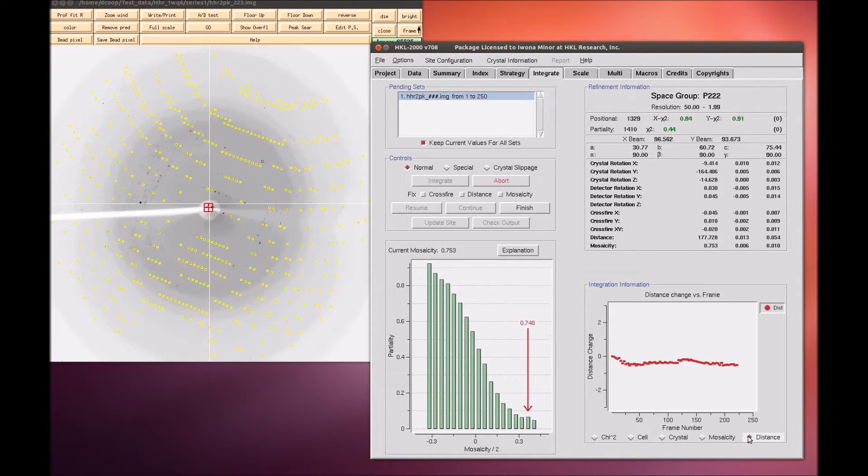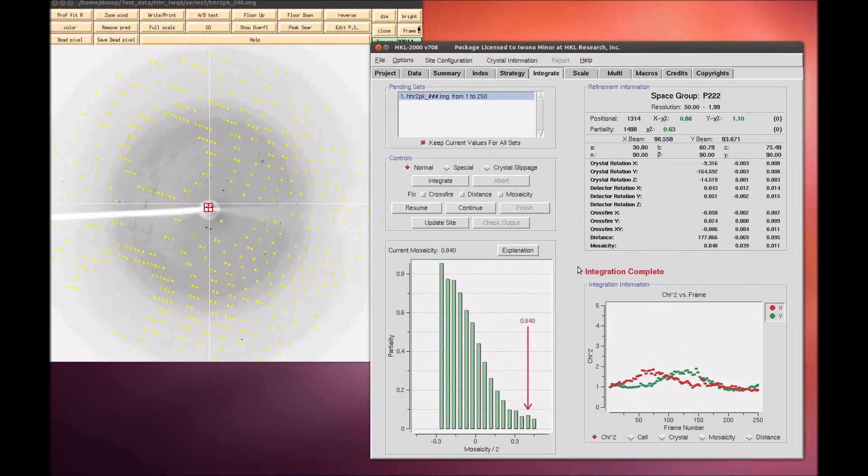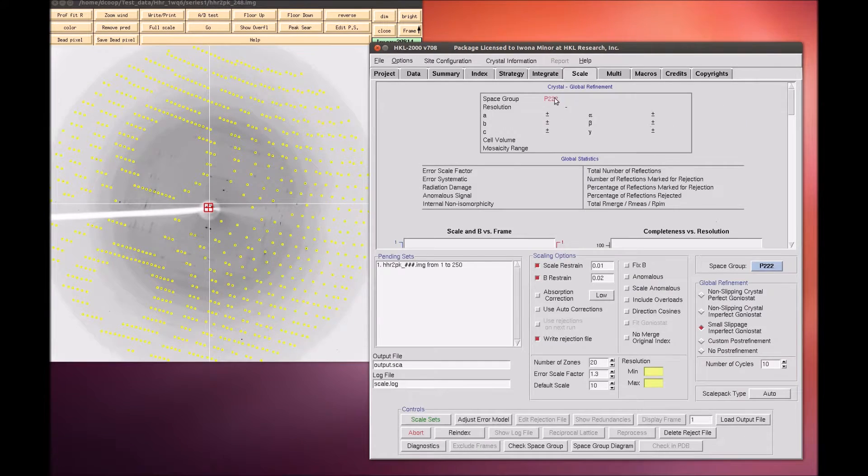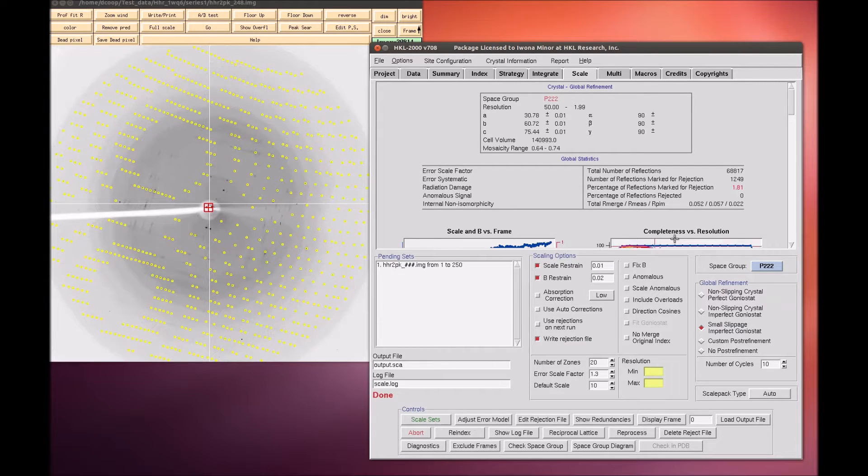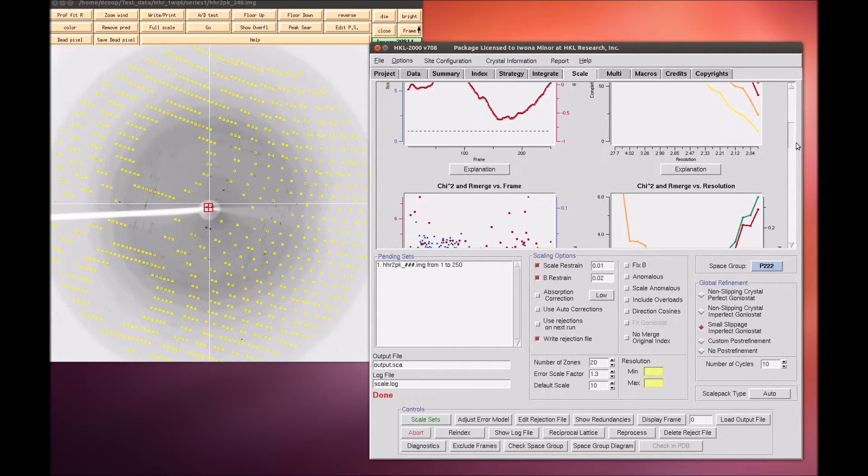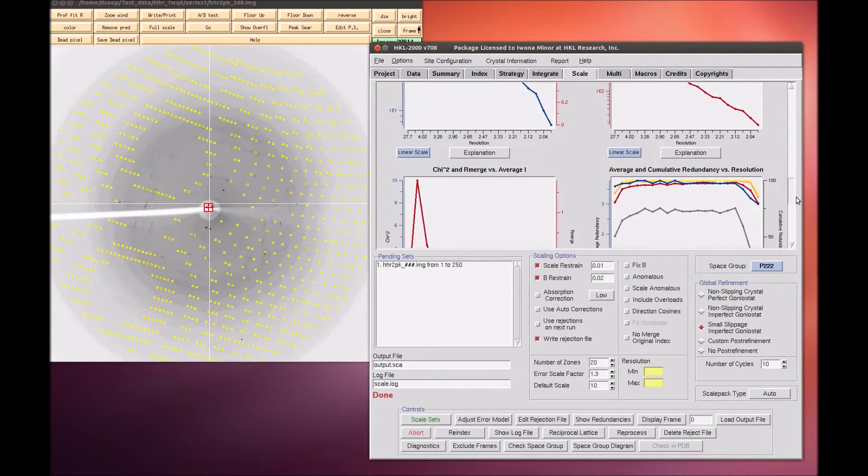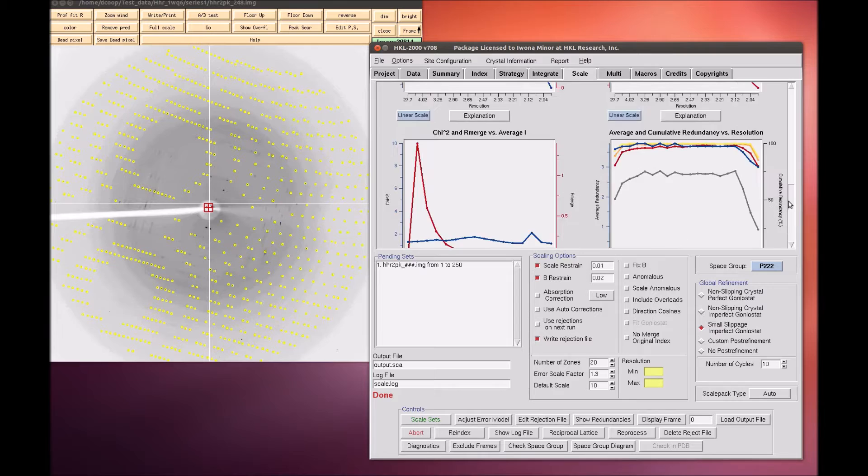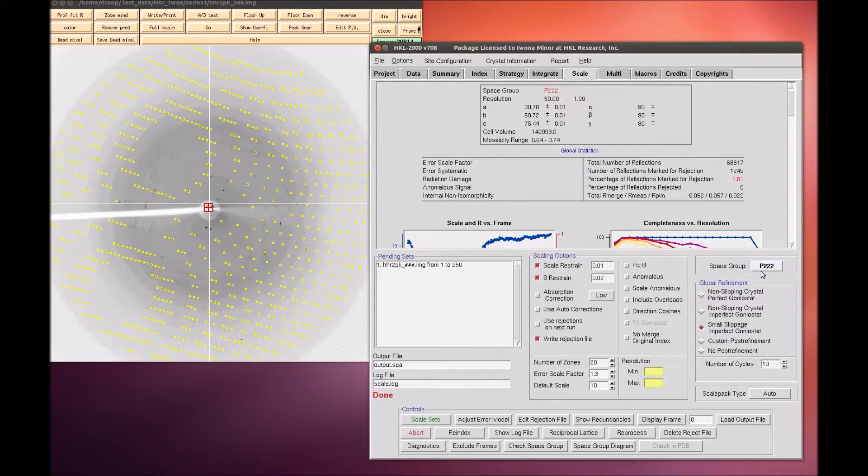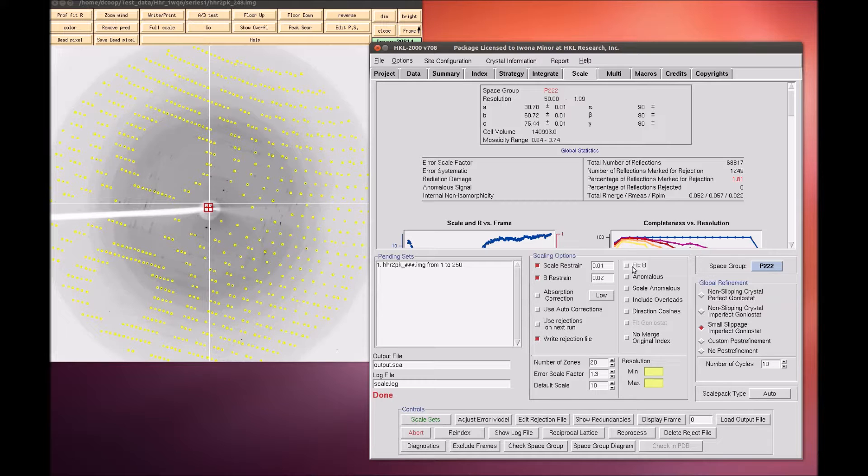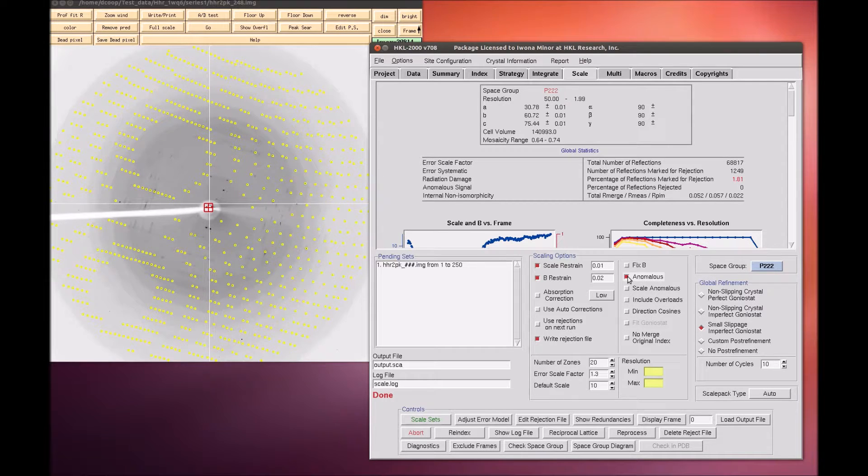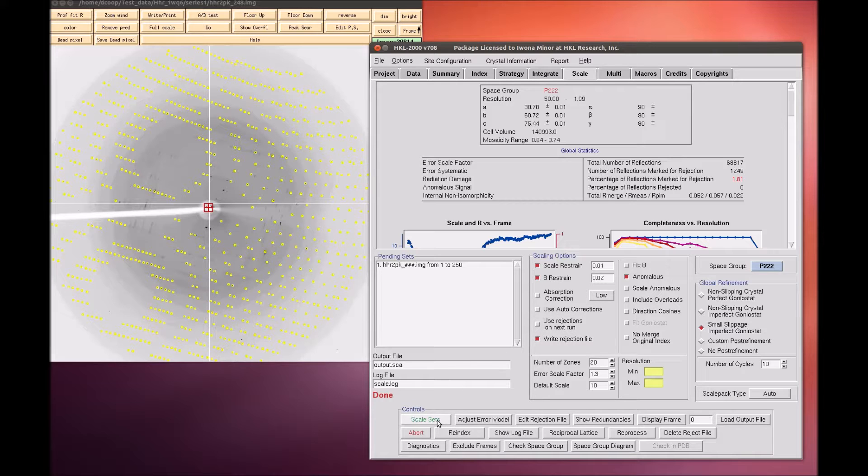Once integration is complete, it is now time to scale the data. To do this, switch to the Scale tab and click the Scale Set button. This process normalizes the intensity of all of the frames, combines the data from the partial reflections, and merges symmetry-related reflections. A good approach to determine the space group is to initially scale the data in the lowest symmetry space group for the crystal class and then use the Check Space Group button. In this example, we know that we intend to use the anomalous signal from the data to solve the structure, so we select the Anomalous button. Leaving the rest of the parameters at their default settings, click Scale Sets.